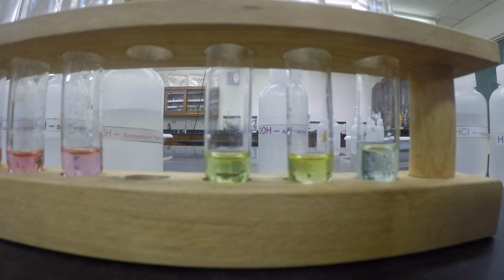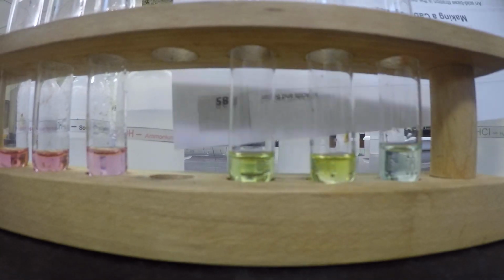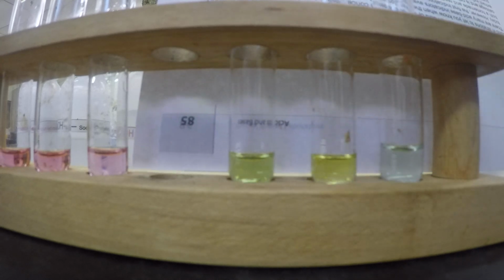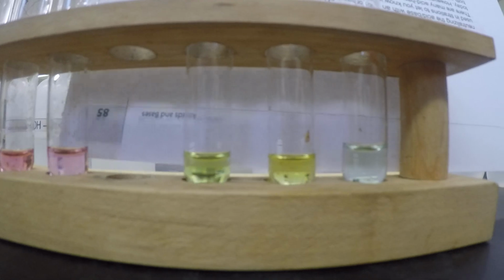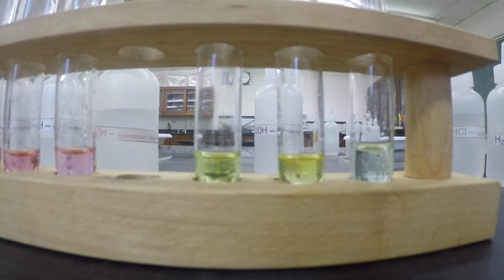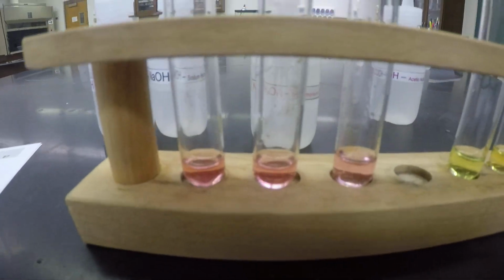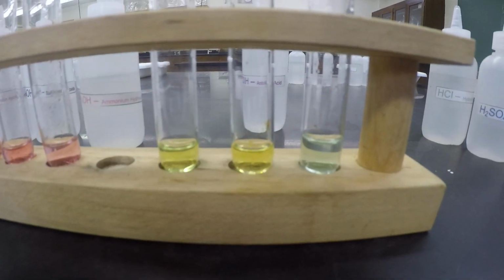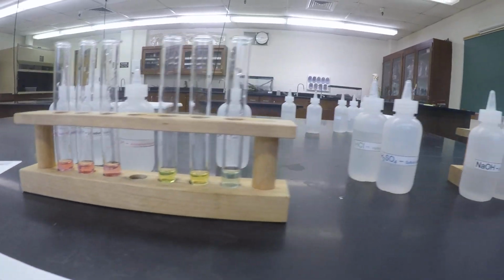I can get a white piece of paper back here for you so you can see. They are a green. It's kind of a mint green. Okay. So when you add acids and bases with cabbage extract, acids turn pink, bases turn like a yellowish green. Okay.